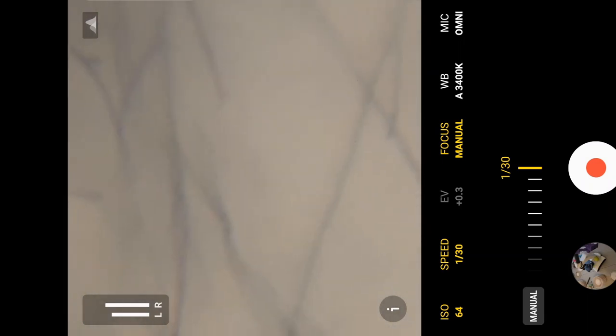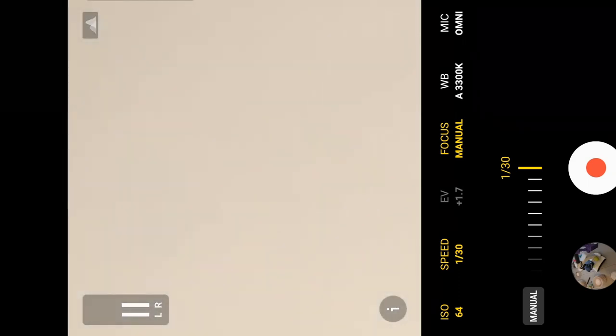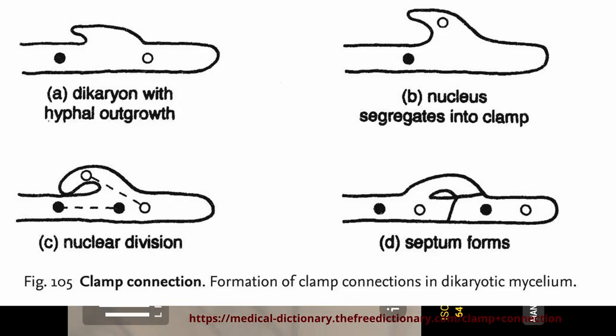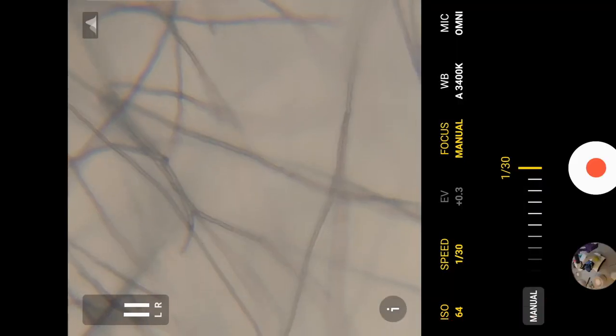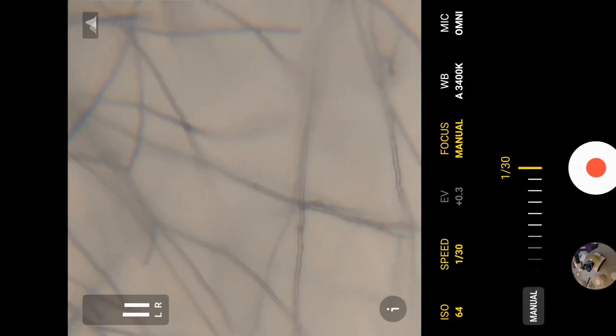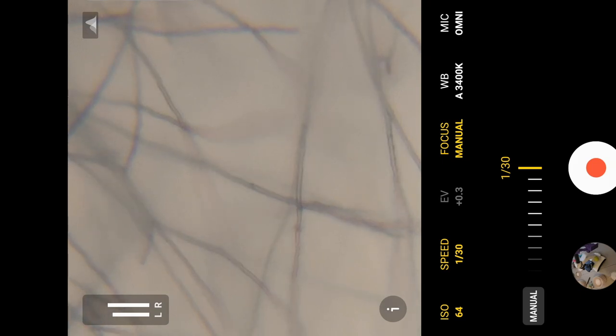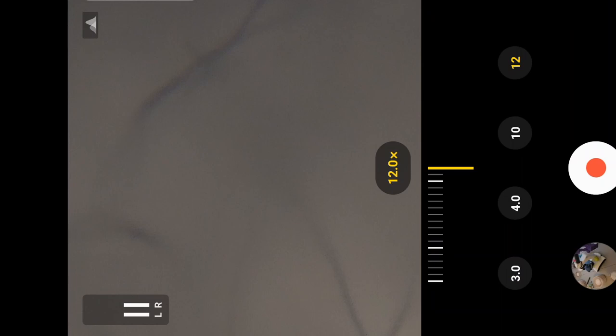Yep, and this is basically how you do it. You just search around the plate. You want to be searching for where the two cells meet. The two cells that make up the hyphae. Because if there's only one nuclei in it, there won't be a clamp connection. And if there's two nuclei, the clamp connection will be used to bridge the connection between the two cells and move the nuclei. The larger your sample size, the better, really.